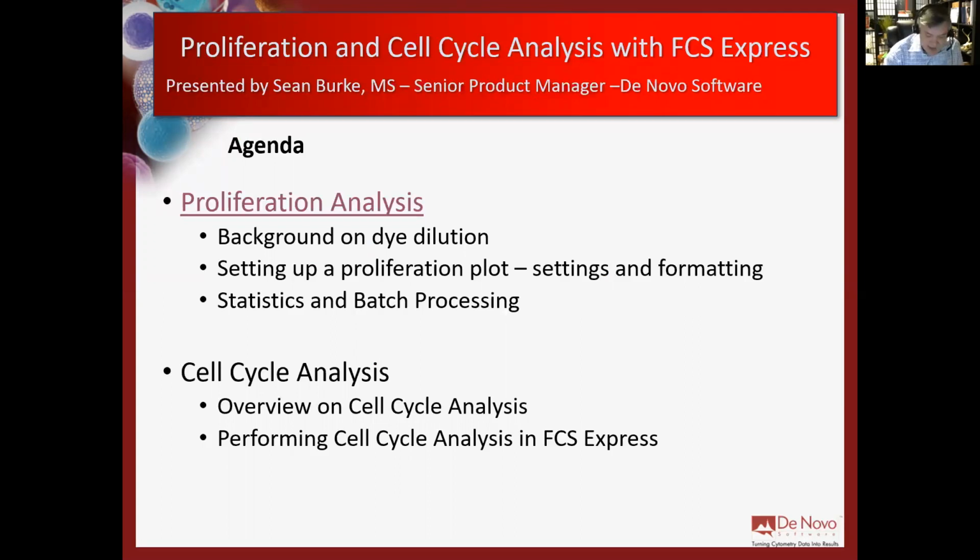Then we'll swing back and spend a little more time on cell cycle analysis, giving you background about how it works and why, and then go over how to perform some of that in the software. Let me launch FCS Express.